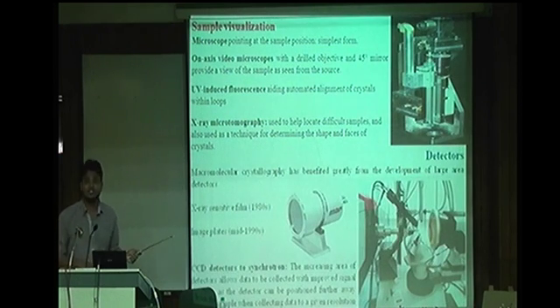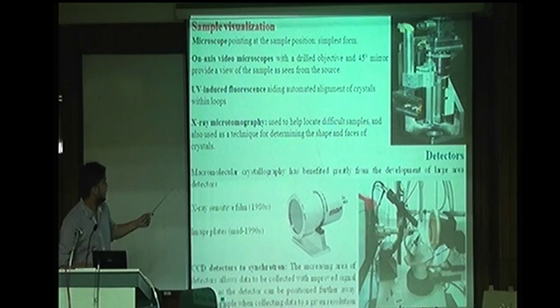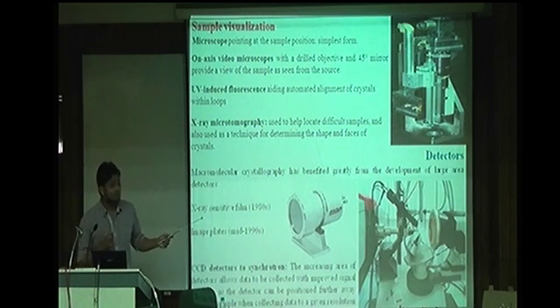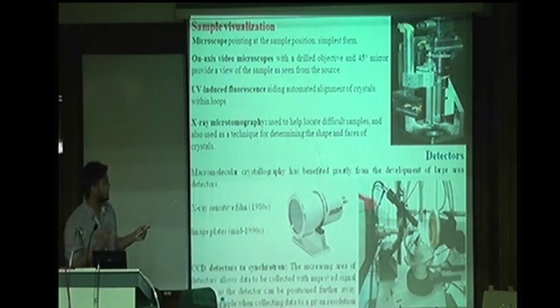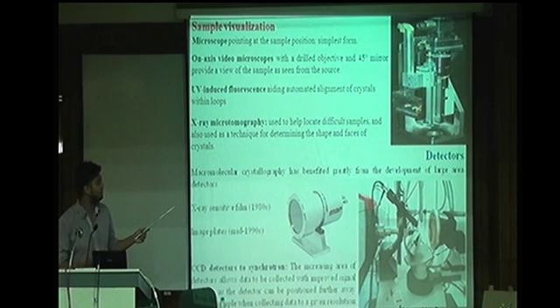Coming to the detectors, which were recently explained to you. The main thing with the detectors is that the area should be large. Macromolecular crystallography has greatly benefited from the development of large area detectors.